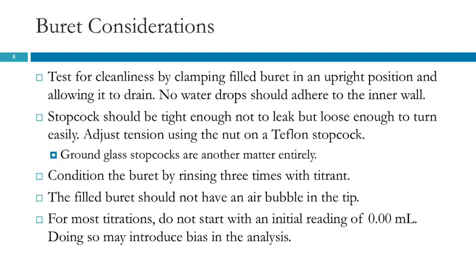If the stopcock is giving you a lot of trouble, it could be that it's assembled incorrectly. There's a washer and an O-ring and a nut, and the washer needs to be against the glass. If the O-ring is against the glass, every time you rotate the stopcock, it will loosen or tighten the nut depending on what direction you're turning it. Extremely frustrating.